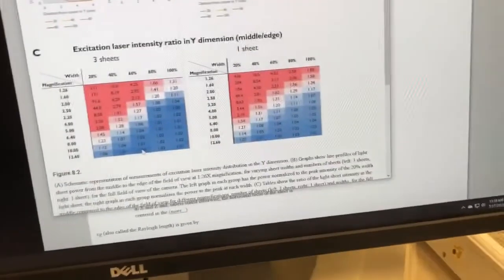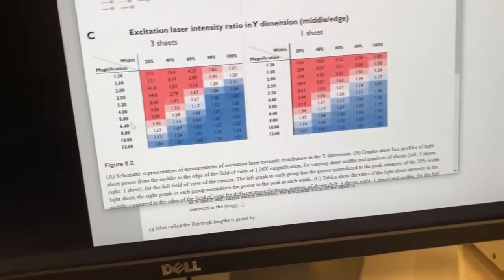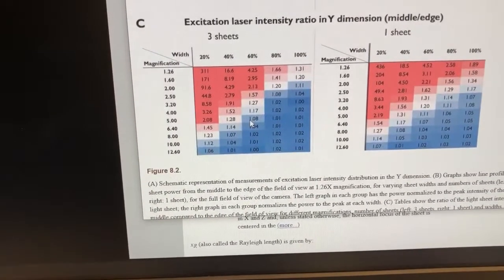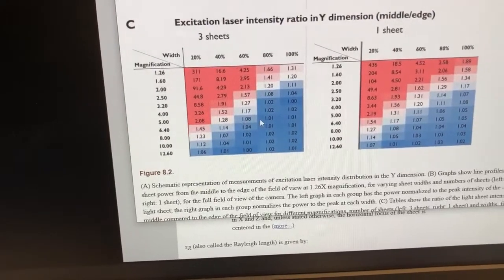So for example, if our total magnification were 5, so if our zoom were half that or 2.5, we could get away with a width of 60% or 80% without paying much of a price in terms of evenness.